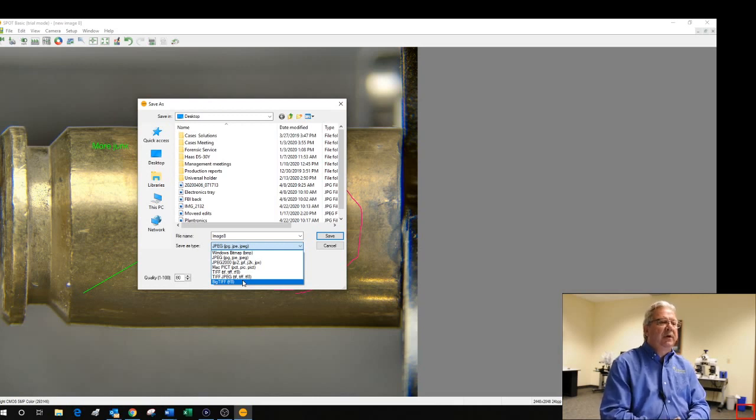Maybe for any of you that are concerned, a big TIFF is the most complete file. There's no compression run on it. All the metadata is there. And again, it's a standard TIFF format. TIFF JPEG is trying to balance the resolution between a compressed JPEG image and a TIFF image. But then you'll see we've also got a standard TIFF, standard JPEG.